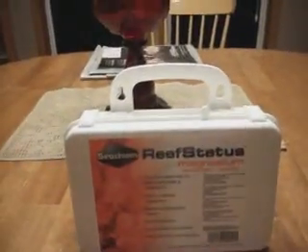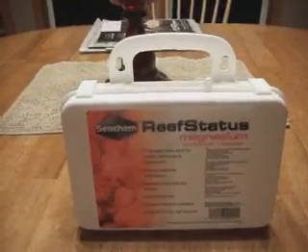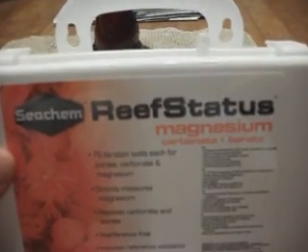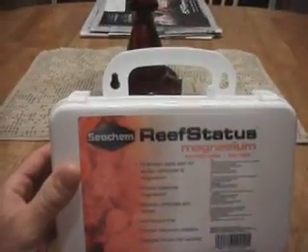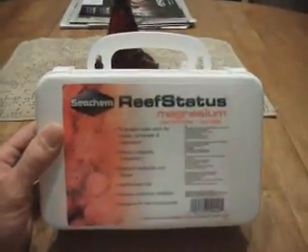Hey guys, it's 1977 Logan here with a little update. I finally have acquired a magnesium test kit. This is a Seachem Reef Status magnesium carbonate and borate test kit. It was a little pricey. I don't know if this is the best test kit for magnesium but I'm going to give it a try.